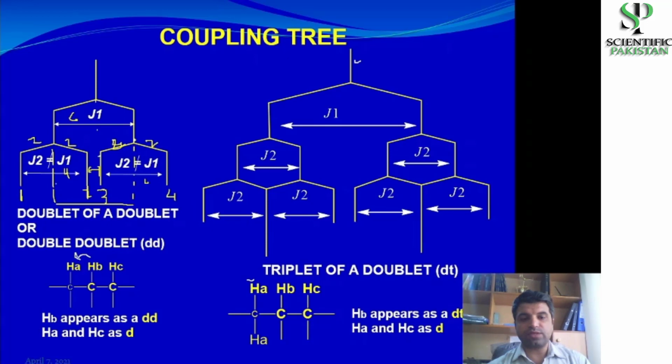The distance from the center to this line is equal to 2. And this center is right underneath these 2 lines, and the distance between them is 6. So if this is 2, this is 2, the gap is equal to 2 hertz. This distance is 2. You need 6. Where is 6? 2 plus 2 plus 2.